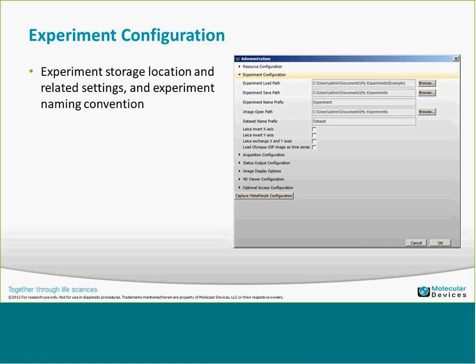There's an option specific for Olympus OIF images — whether you want to load them as a time series, check that box and they'll come in as a time series in the multidimensional configuration. The acquisition configuration settings show the paths for the master hardware profile file, user hardware profile files, and a scratch folder used by the custom analysis tools for temporary image storage.